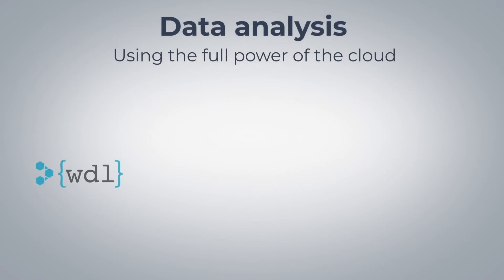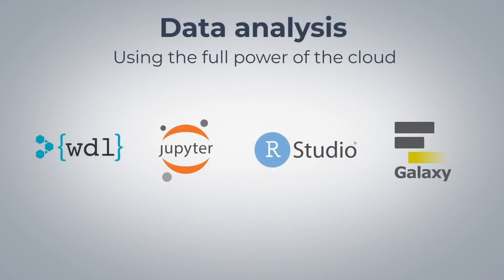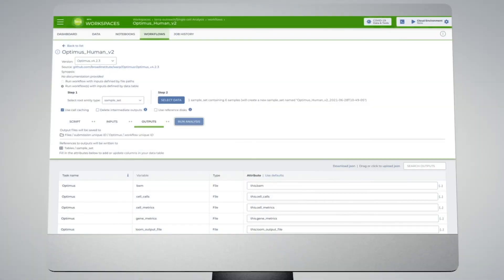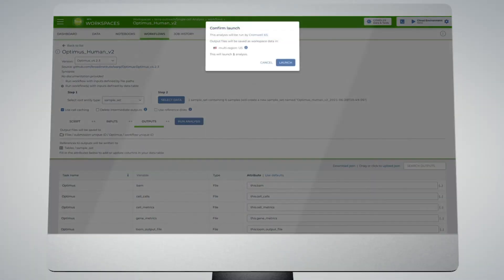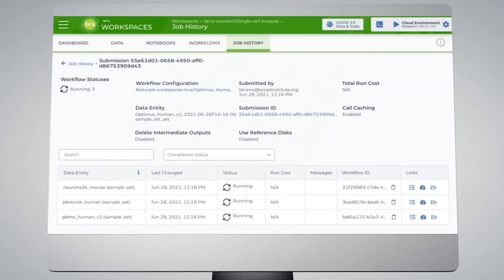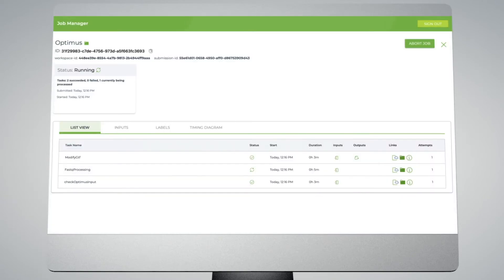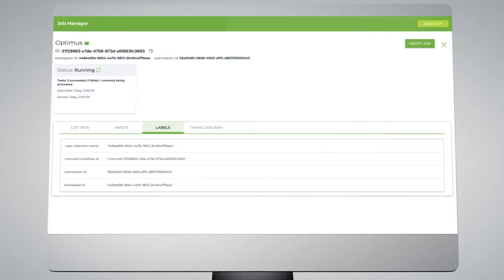Terra offers multiple options for analyzing your data using the full power of the cloud through interfaces that are tailored for biomedical researchers. You can launch massively scalable workflows from a simple configuration form and monitor progress visually as the system executes the work on virtual machines in the cloud.